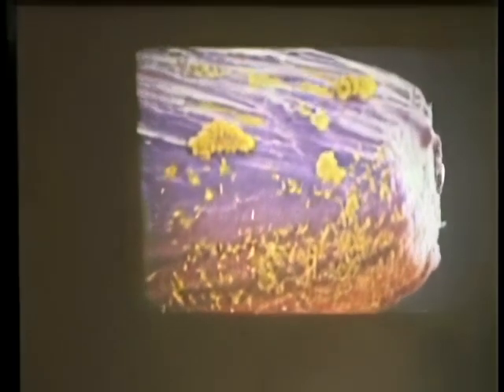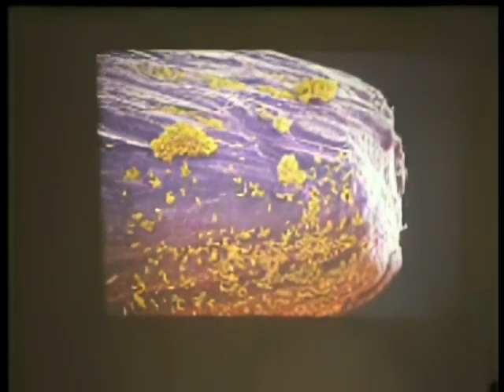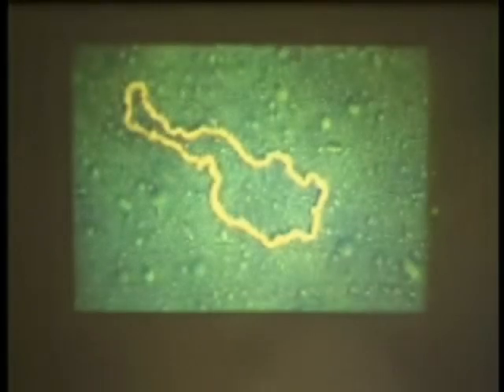And so it's looking at it with improved resolution. You can begin to see the bacteria very clearly on the pinhead, and if we go to the next picture, the bacteria begin to look like fish fingers now. And these are E. coli. If we go on to the next picture, we're now getting down to the level of you're seeing the strands of DNA, and this has been coloured by an artist, so it is clearer. And I think there's maybe one more. Yes, that's as far as we go.